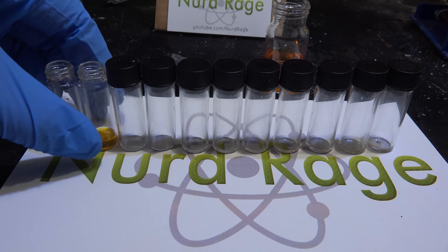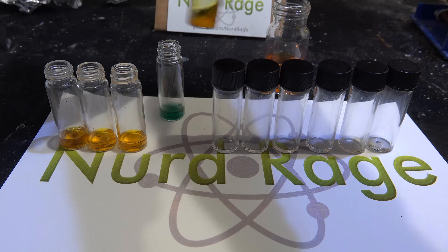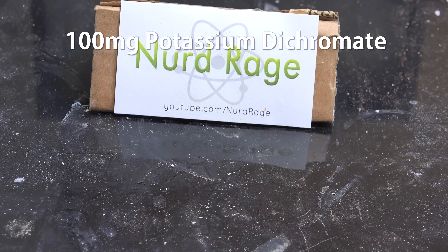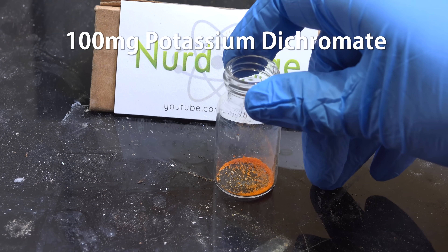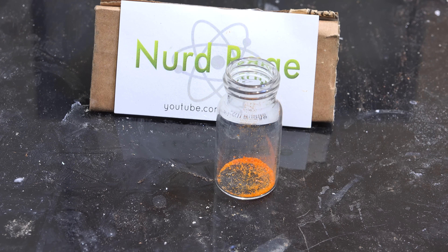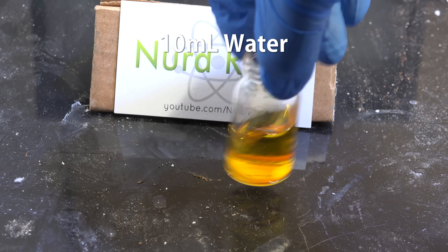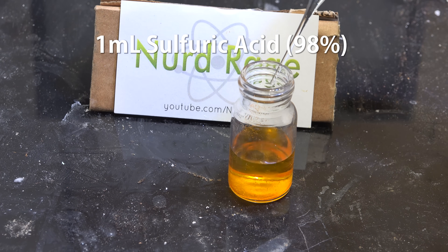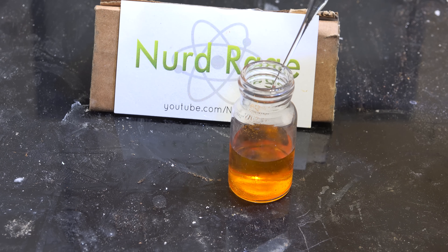The first is the dichromate test, and to do that we'll need some dichromate test solution. Start with 100mg of potassium dichromate. You can also use ammonium or sodium dichromate — it doesn't matter as long as it has dichromate ions. Then add in 10mL of water. Now add in 1mL of concentrated sulfuric acid and shake everything until it's dissolved. You can use more sulfuric acid if you desire increased speed.